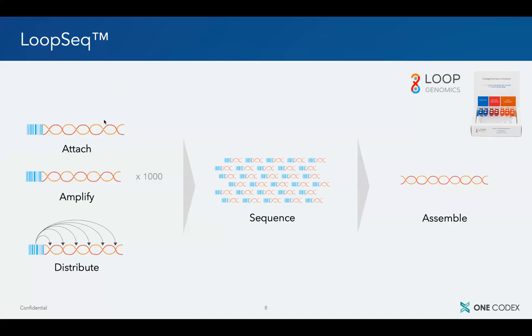And that gets us synthetic long read data that is a consensus sequence. We'll talk about what the properties of that consensus sequence are, and it covers all the variable regions in the 16S gene. We'll talk about some of the benefits of that from an informatic perspective, and from the perspective of what it implies for microbiome sequencing and what that provides downstream.